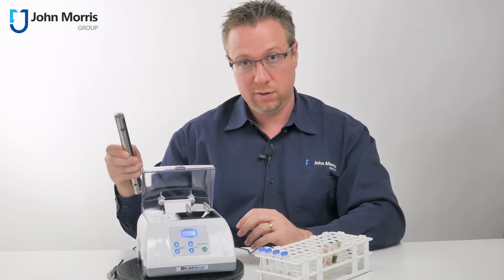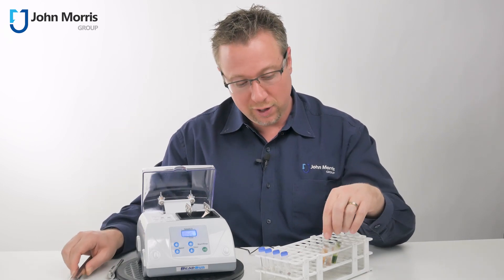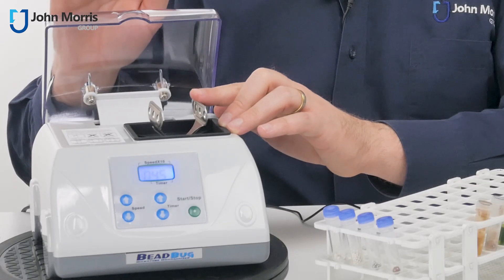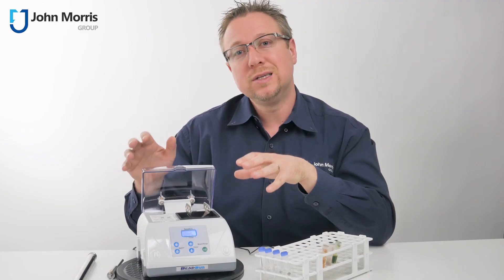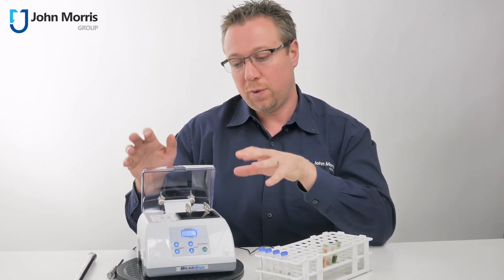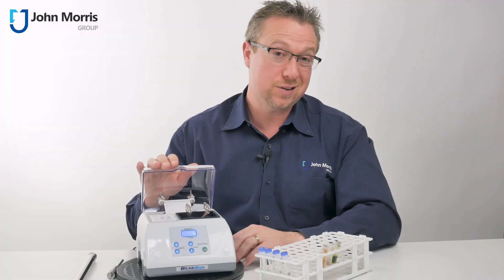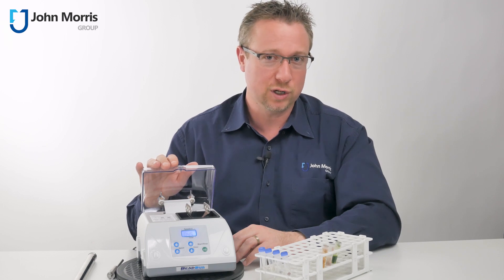Plus you don't need to do laborious cleaning in between homogenizations, and you get a very effective result. It's also available in a six-position and a 24-position design, and honestly at this price point we think this is a fabulous package for homogenizing and lysing your difficult samples. So that's the awesome Beadbug 3 from Benchmark Scientific. Thanks so much for watching and bye for now.